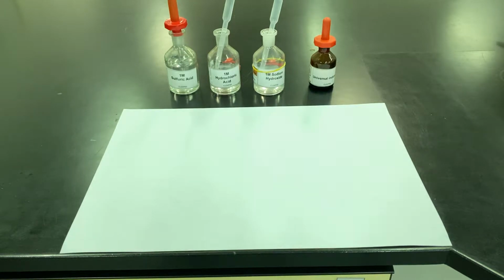Right, in this short video I'm going to show you some neutralization reactions. I'm going to show you some acid metal reactions, but the idea is I want to show you how salts are produced when acids and alkalis behave in chemical reactions. So let's look at one we've already seen before. Let's look at the neutralization reaction between sodium hydroxide and hydrochloric acid.